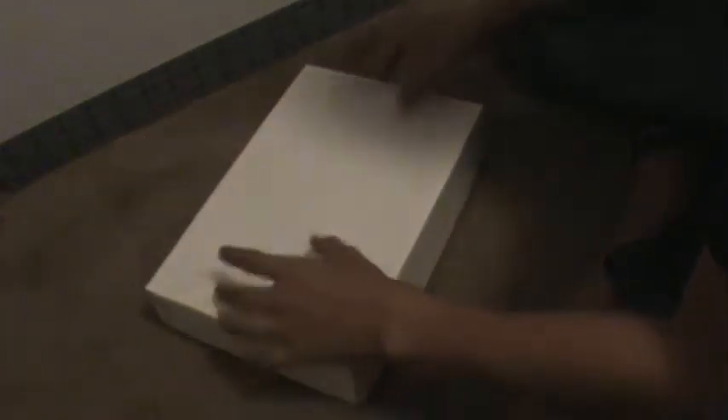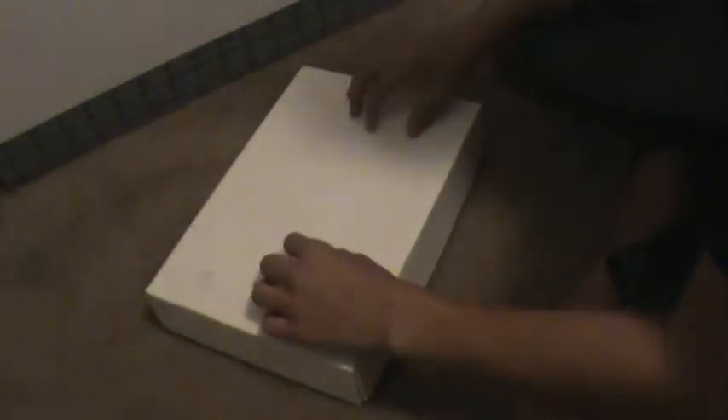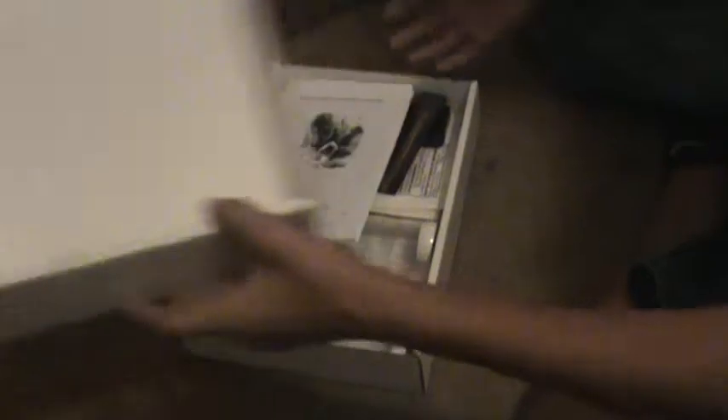This is a package from BioQuip. It came in this box here. Let's go ahead and open it up. This is basically an insect entomology pinning kit for display as well as storage for insects and whatnot. So it's pretty cool.